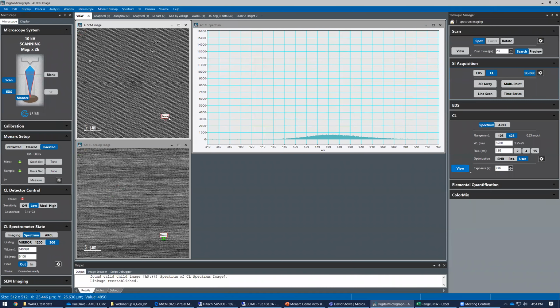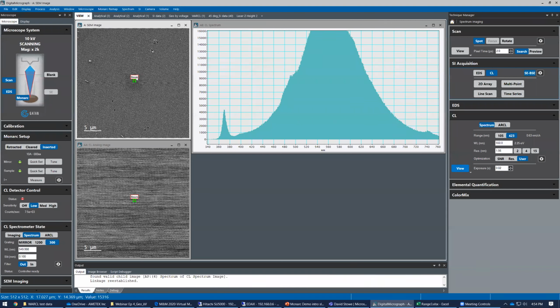So if a ray is coming in at an angle, how does that get misread as a different wavelength? I don't know that it's misread. I don't know that I would call it that, but it can make it to other channels, basically. If it's off axis, it won't follow the appropriate beam path, so it'll be slightly away from that. There's a numerical aperture that determines the acceptance angles for light entering the system.